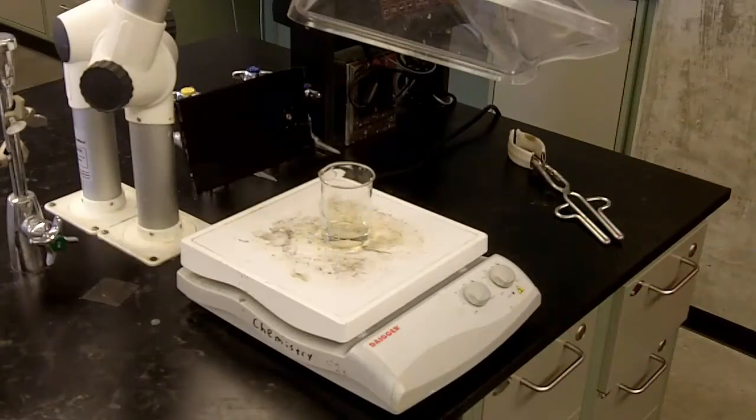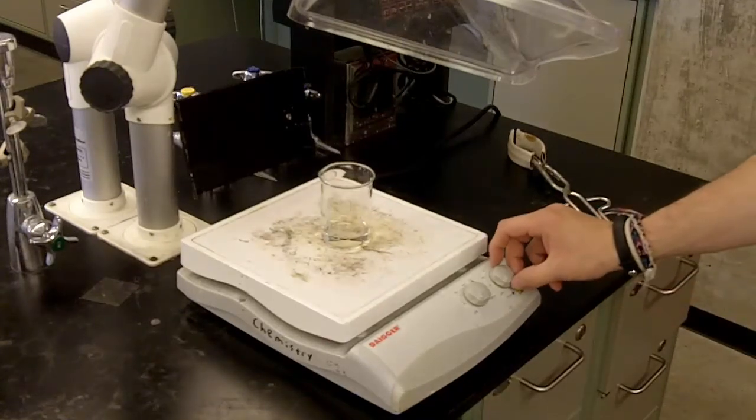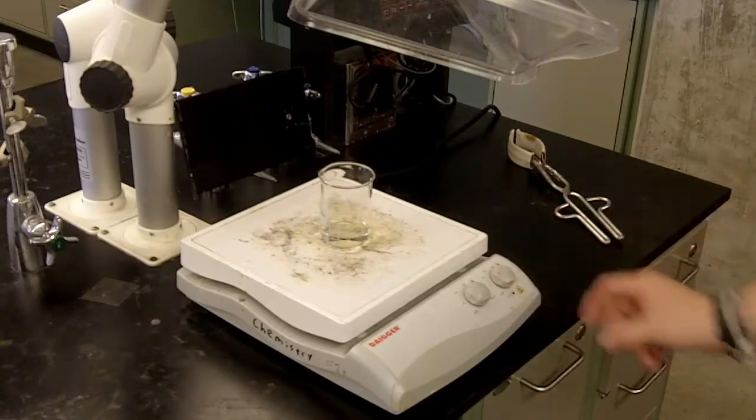Okay. So what we're doing here is we're going to show the actual reaction as it occurs. And the first thing that we've done is we've measured out HCl and put it inside the beaker, and that is sitting on top of a hot plate. So we'll go ahead and turn on the hot plate to start heating the HCl.